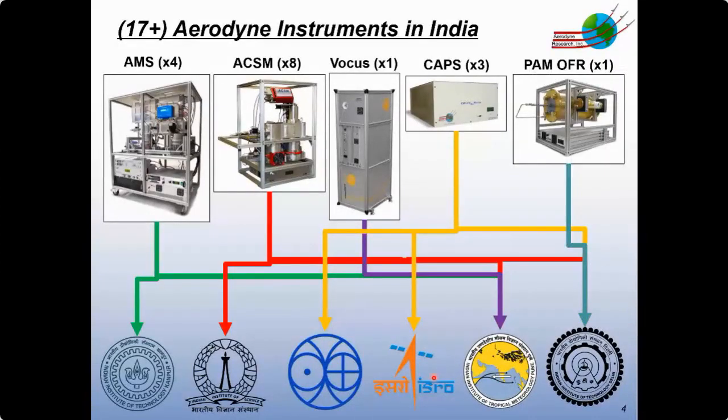And then finally, what will be the focus of the talk today, we've delivered 1 PAM oxidation flow reactor to the group in Delhi. And as with that instrument and with all these, as I said, we hope that this is going to continue to grow into the future through research collaborations with groups in India and government and universities and so on.